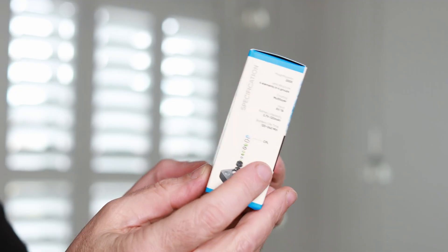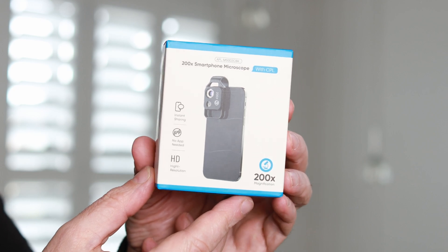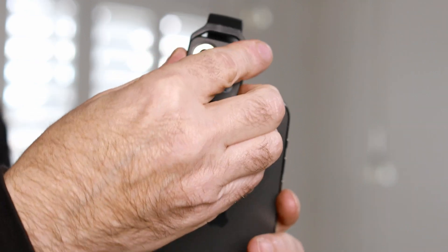Today I'm going to be unboxing and reviewing the Apexel 200x Microscopic Lens. This is a compact hardware device that you can clip on to just about any iPhone or Android phone.